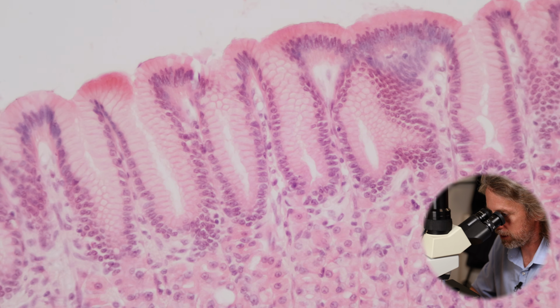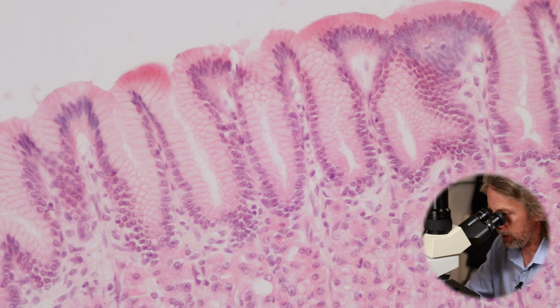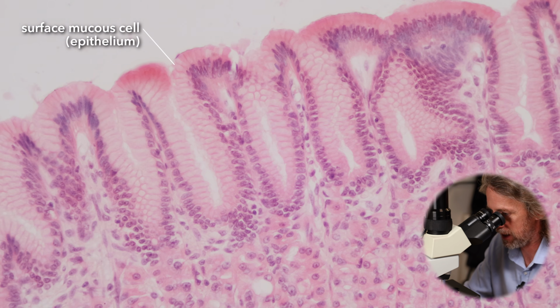Now, so that's the epithelium. It is a single layer of cells, so it's a simple epithelium. The cells are tall, so it's a columnar epithelium, so it's a simple columnar epithelium. And there are a lot of surface mucus cells, SMCs. I don't like abbreviations. Surface mucus cells, these are cells on the surface making a lot of mucus.